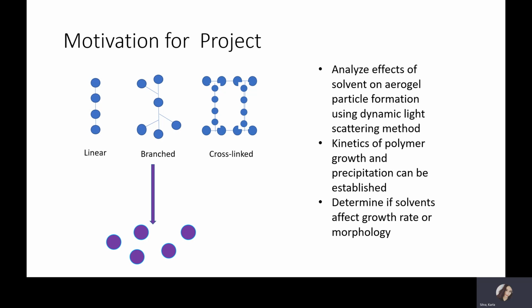So this is what we don't know, and that's the purpose of my project, to analyze the size evolution of these particles. And this is done using dynamic light scattering. Another portion of my project is to eventually study how different solvents affect the growth rate or morphology of the aerogel formation.